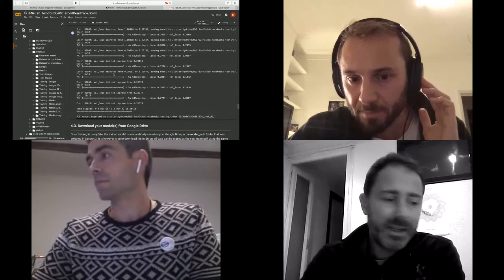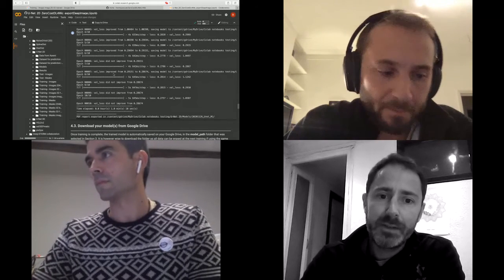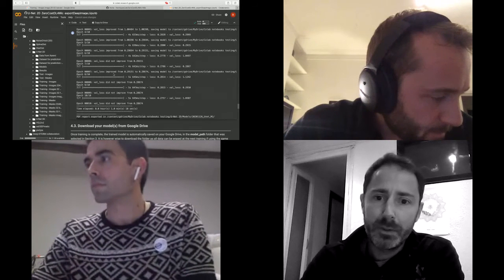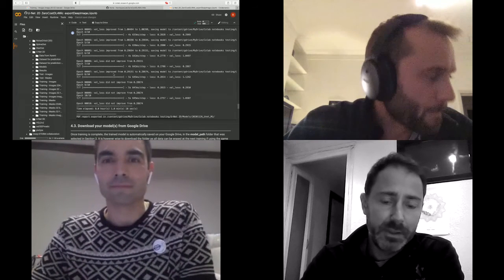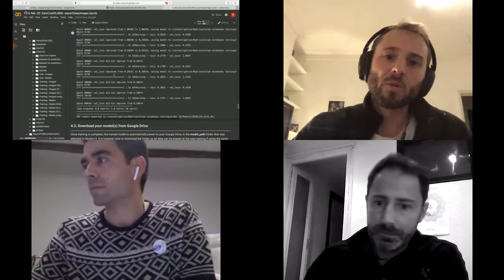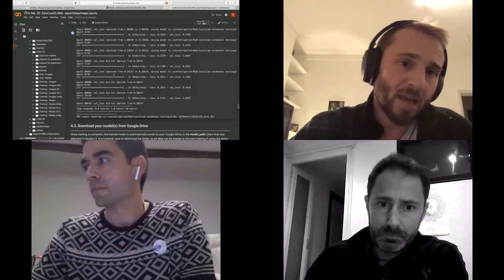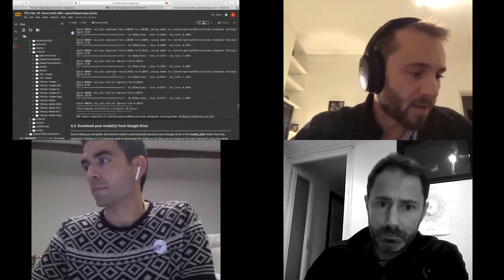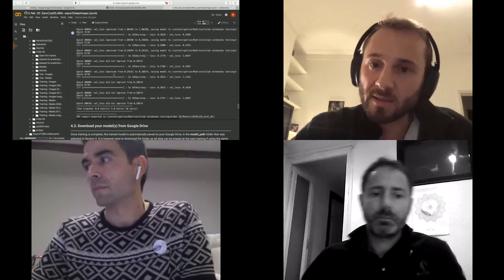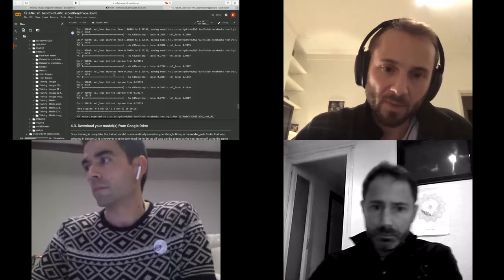Romain, do you want to take a quick question first? Martin Kenny is asking how many images are required for training a pix-to-pix network, more or less. So pix-to-pix is a bit of a funny beast because it's a GAN, a generative adversarial network, and in our hands, it's required a few hundred images, right?